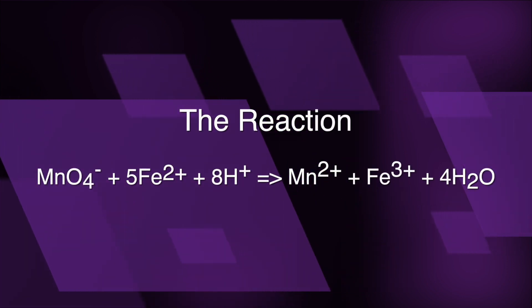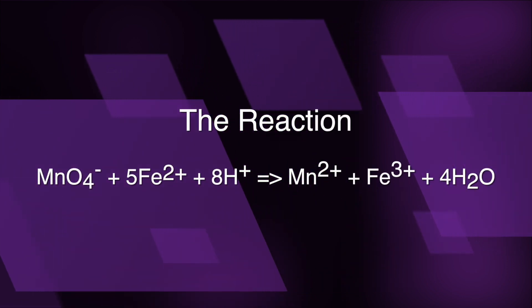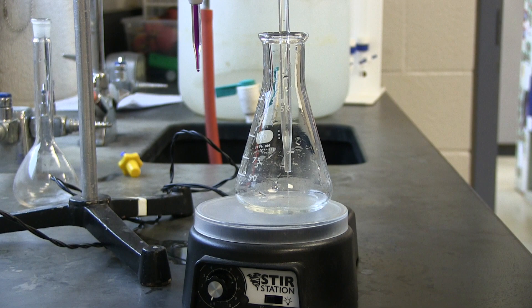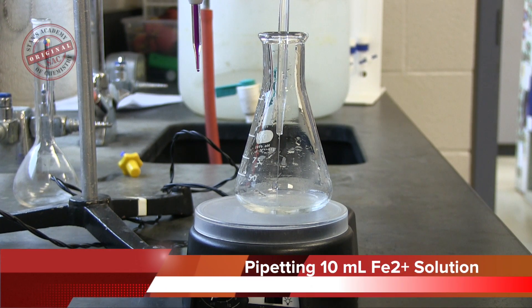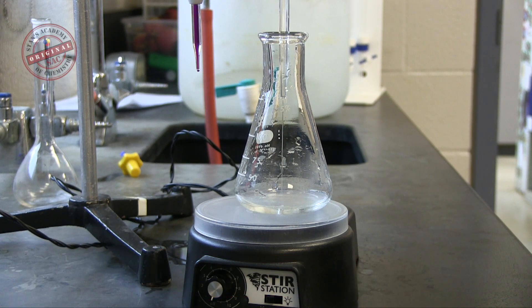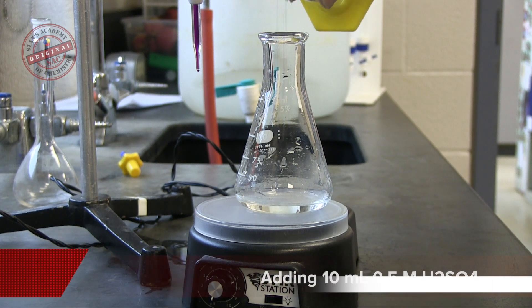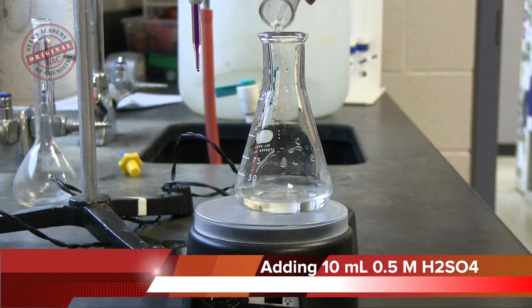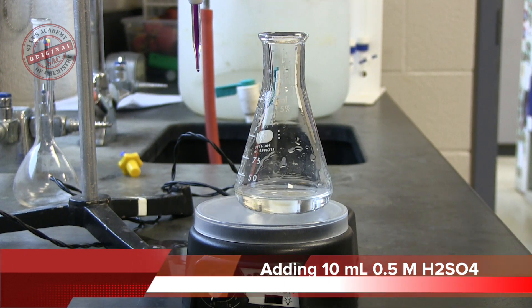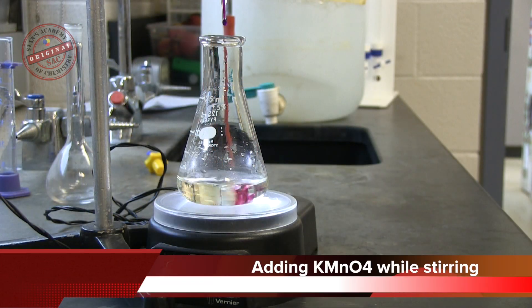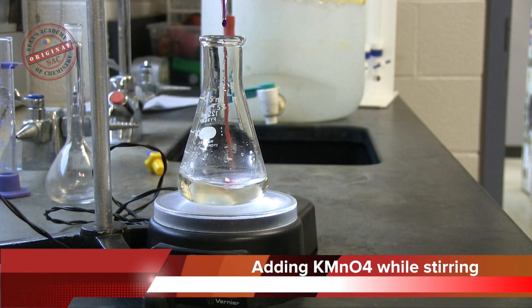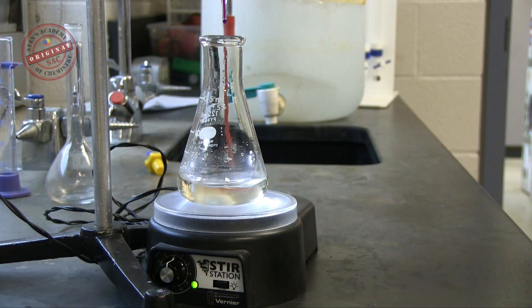This is the reaction on which the lab is based. After pipetting 10 ml of the ferrous ion solution into an Erlenmeyer flask, add about 10 ml of 0.5 molar sulfuric acid. Now add potassium permanganate from the burette. Use a stir station to constantly mix the solution.